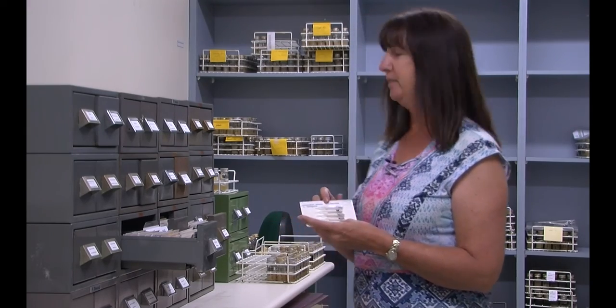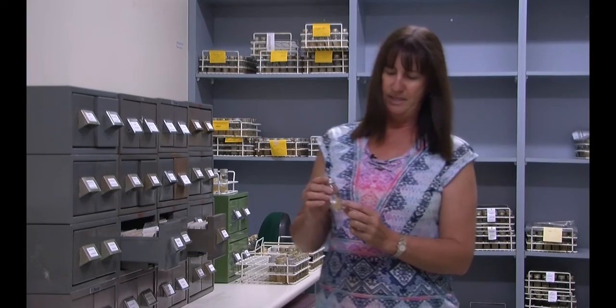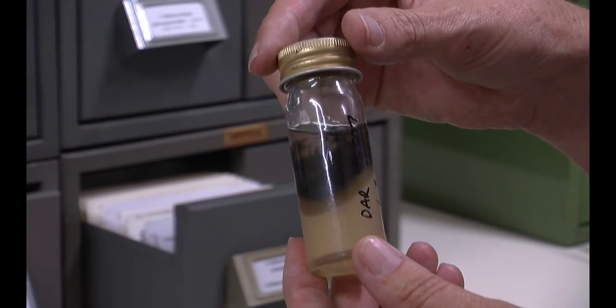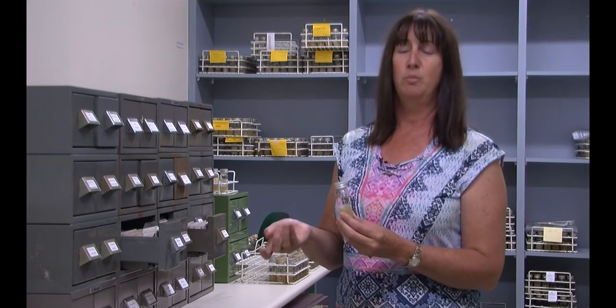We also have an older method where cultures are grown on agar and stored under a sterile mineral oil, which stops air getting to them and halts further growth. They're good on this for about three years, but we have to continuously grow them out and transfer them onto new media, otherwise they will die.